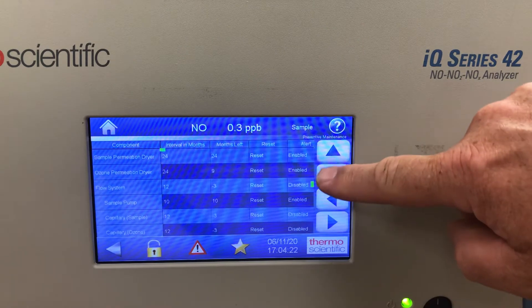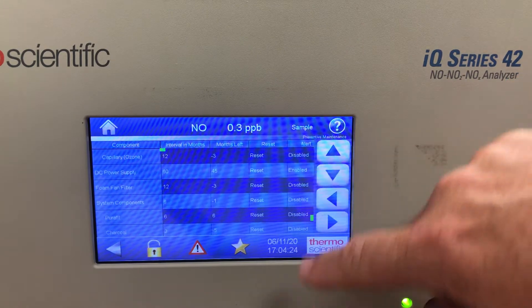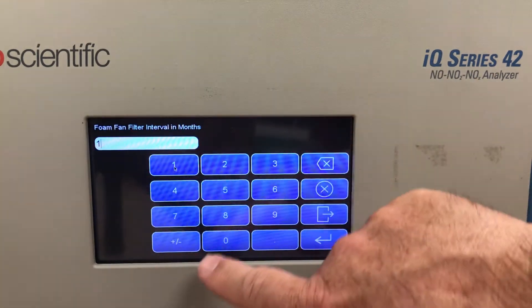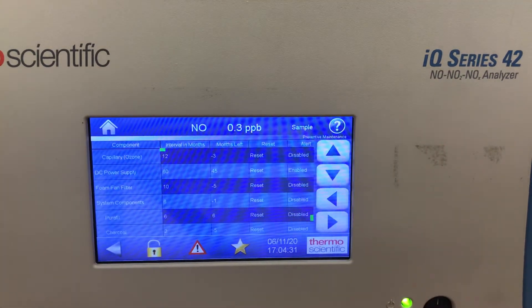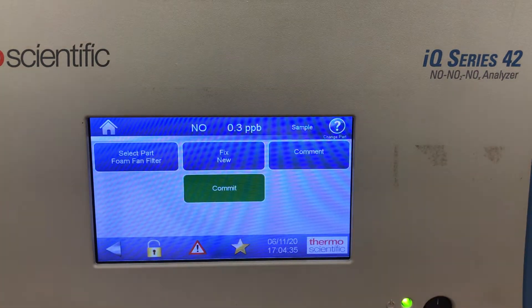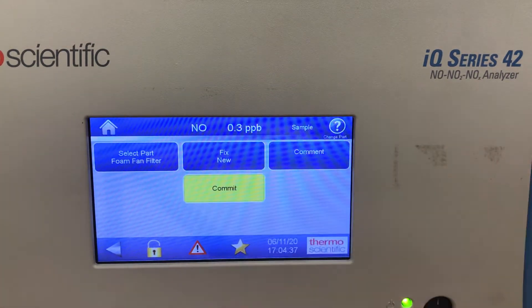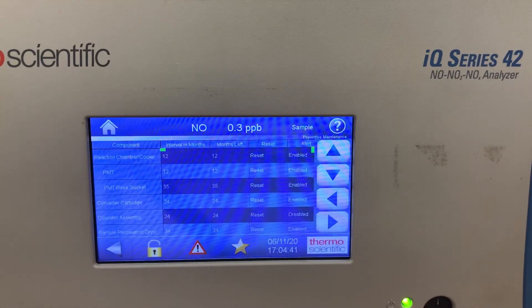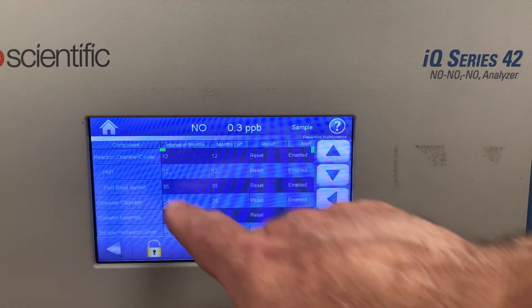You can see the different parts you can change and set the interval. If I want a 10-month interval, I enter it and it will count down for 10 months. I can reset it if I want to — just set the interval back to the beginning again, 36 months.